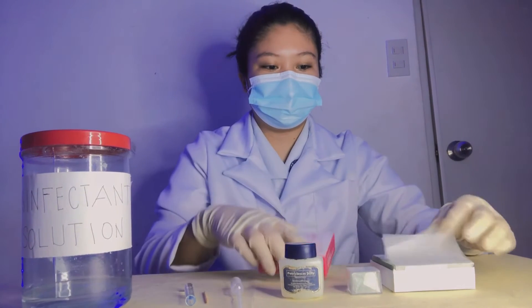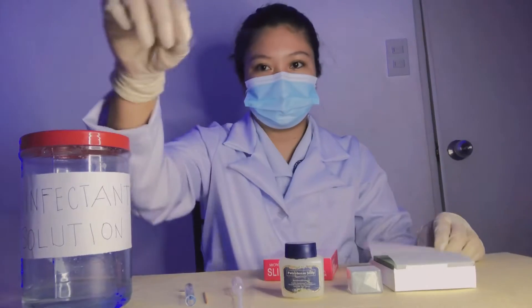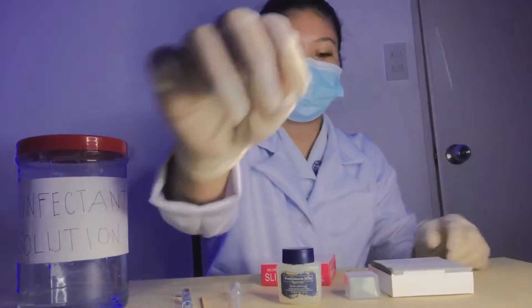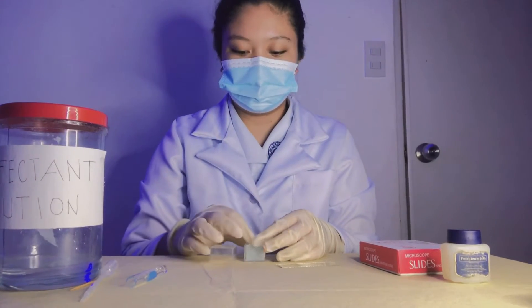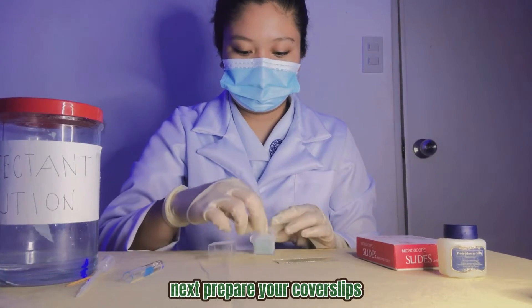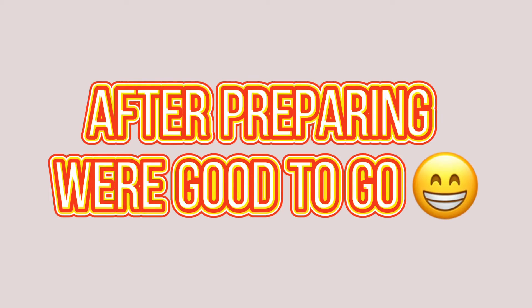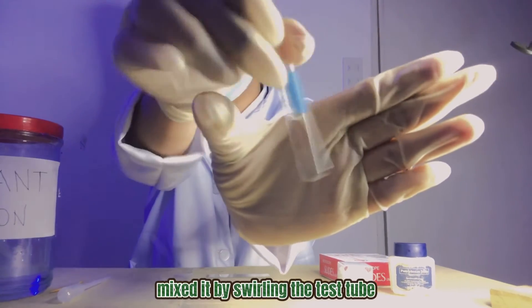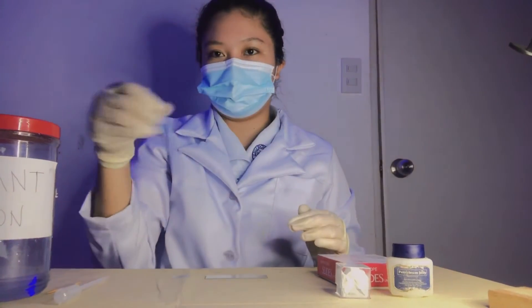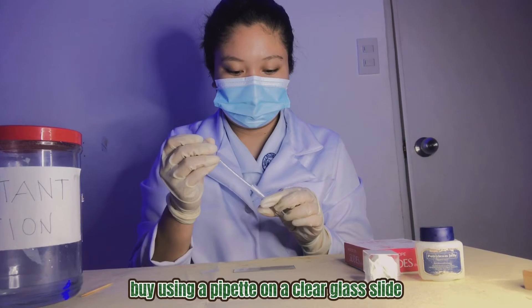Wet mount preparation. First, prepare your glass slides. Next, prepare your cover slips. After preparing, we're good to go. Get the specimen and mix it by swirling the test tube several times. Transfer the water sample by using a pipette onto a clear glass slide.